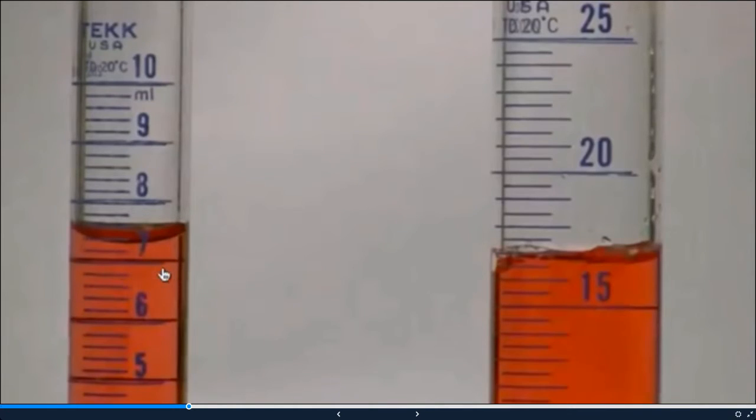Let's measure the volume on the smaller graduated cylinder. This line here is a 7 milliliter mark. These little hashes are 0.2 milliliter marks, so this is 7, 7.2, 7.4. The meniscus looks like it falls underneath the 7.4 mark, so an accurate reading would be 7.3 milliliters. If you said 7.4, that's acceptable too.